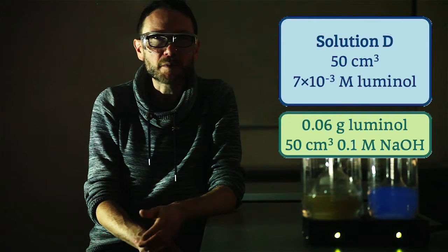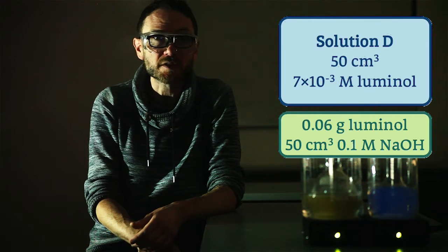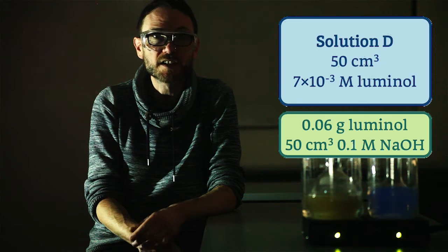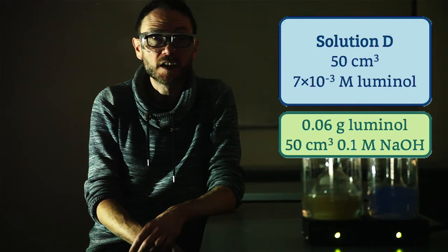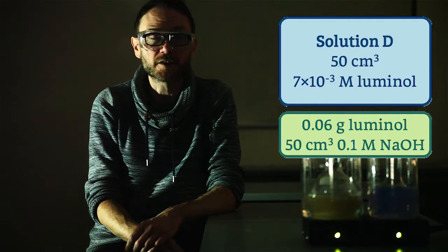If you don't have any 0.1 molar sodium hydroxide made up, of course you can just add 0.2 grams of sodium hydroxide pellets to 50 cm³ of deionized water. You cannot substitute, as I mentioned before, for ammonium hydroxide.